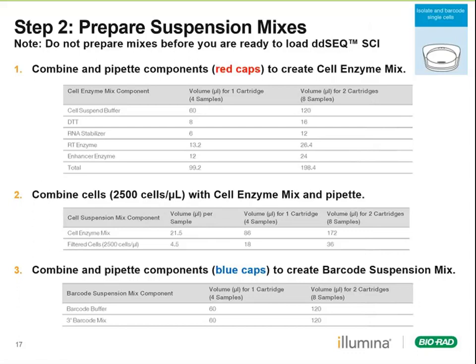Separately, we're going to create the barcode suspension mix, which contains the barcoding reagents and is helpfully labeled with blue caps. At this point, we have two final mixes, the cell suspension mix and the barcode suspension mix.